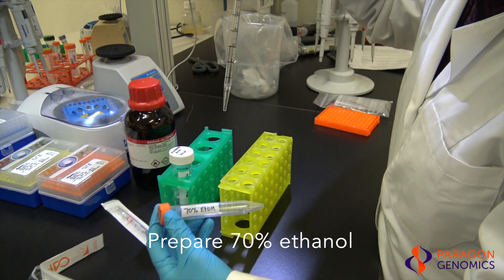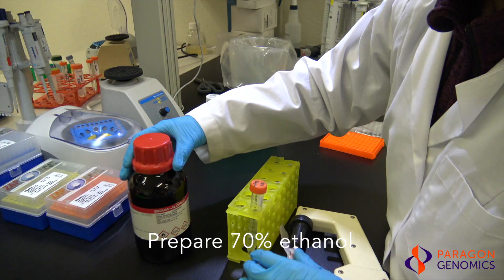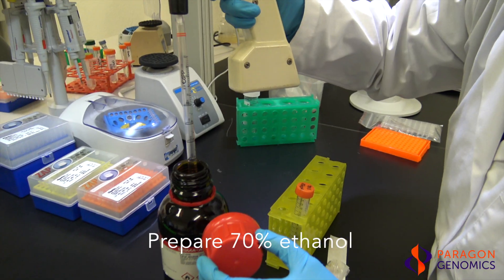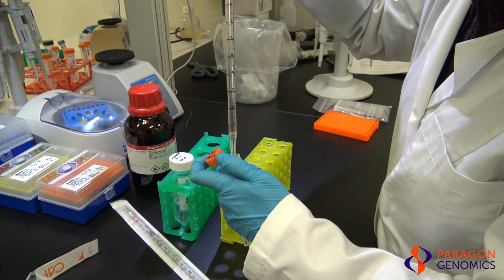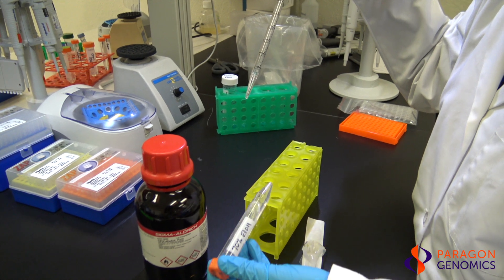Lastly, make fresh 70% ethanol solution daily by combining three parts nuclease-free water with seven parts molecular biology-grade absolute ethanol. Do not make up volume with one liquid in a volumetric container — measure ethanol and water separately and then combine. You are now ready to begin the CleanPlex targeted library preparation protocol.